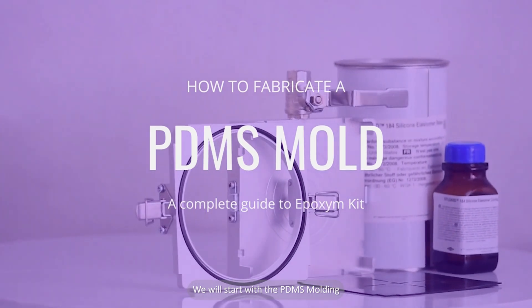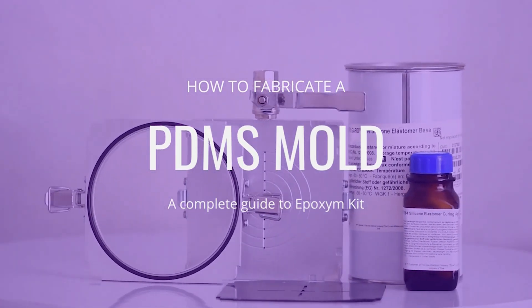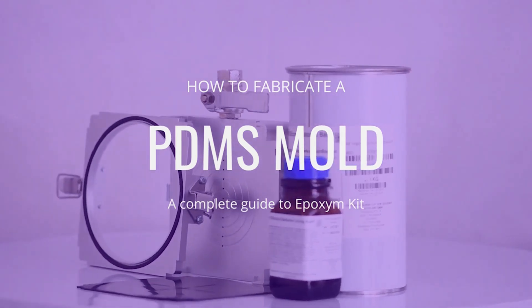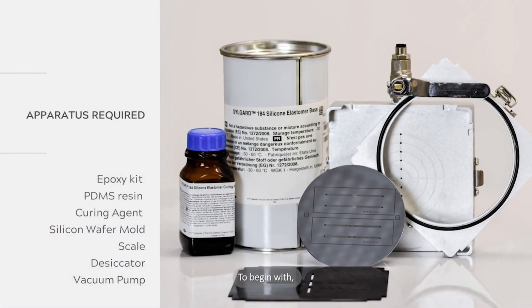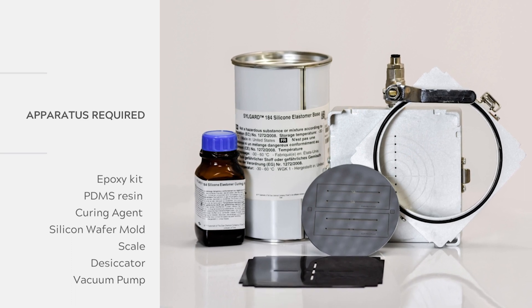We will start with the PDMS molding. To begin with, you will need the following tools: epoxy kit, PDMS resin, curing agent, silicon wafer mold, scale, desiccator, and vacuum pump.